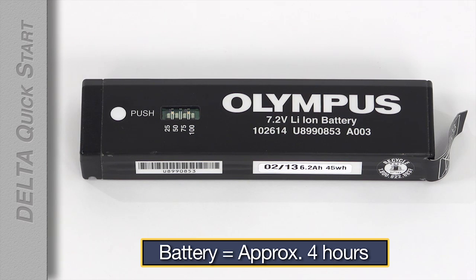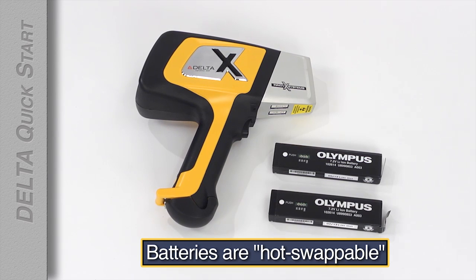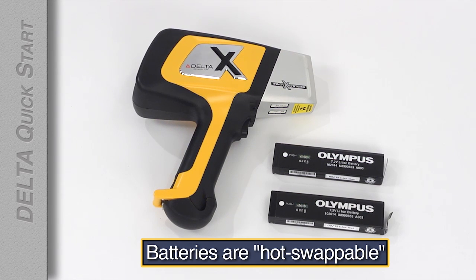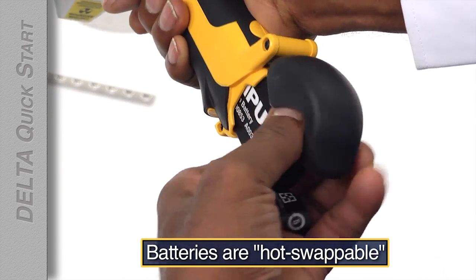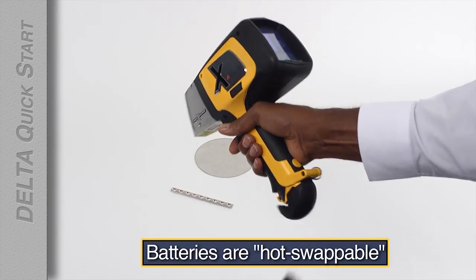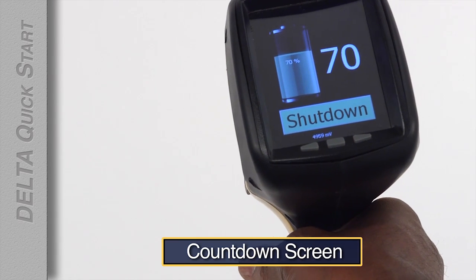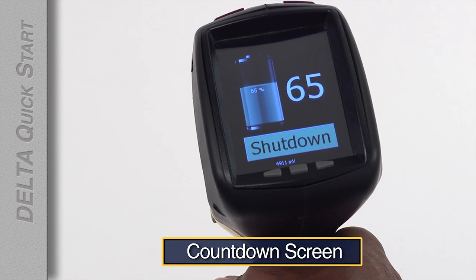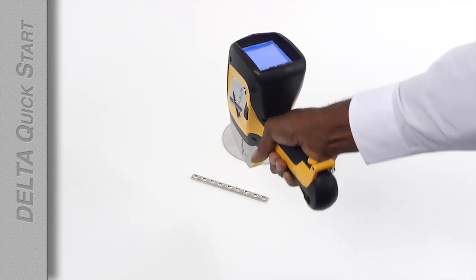The battery in the analyzer should last for about four hours. All Deltas have hot swappable batteries, so you don't have to power down the analyzer just to put in a fresh battery. To swap batteries, just open the battery latch, pull out the battery, and insert a fresh one. A countdown screen shows you how much time you have to complete the swap. Once the fresh battery is in, you can keep right on testing.